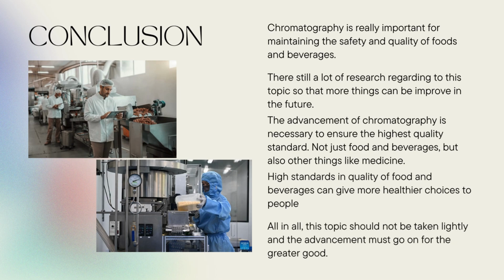Now we reach the conclusion of this presentation. To conclude, chromatography is really important for maintaining the safety and quality of foods and beverages. There's still a lot of research regarding this topic, so that more things can be improved in the future. The advancement of chromatography is necessary to ensure the highest quality standards, not just for food and beverages, but also for other things like medicine. High standards in the quality of food and beverages can give people healthier choices. All in all, this topic should not be taken lightly and the advancements must go on for the greater good.